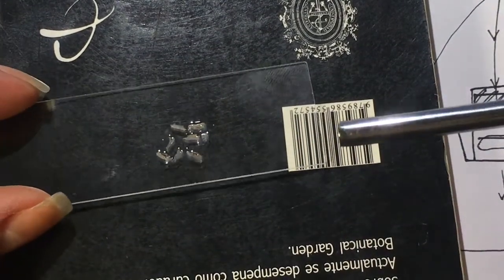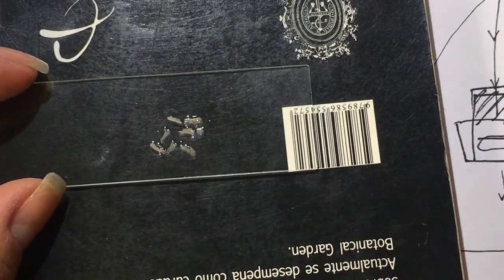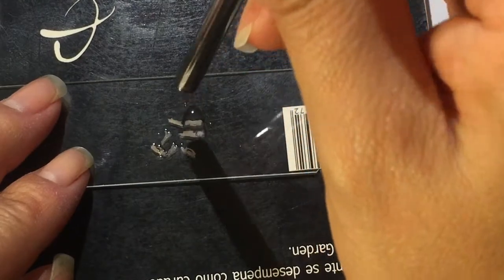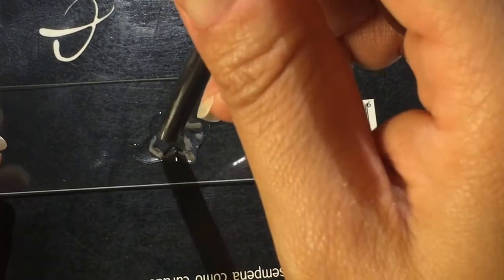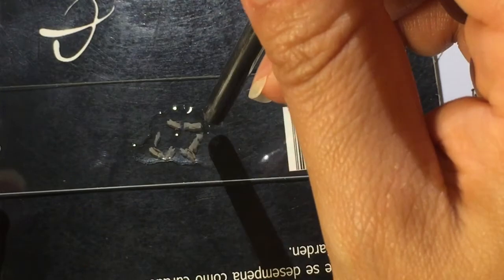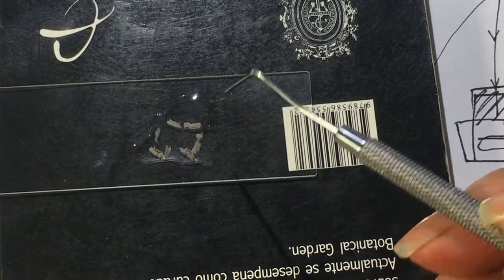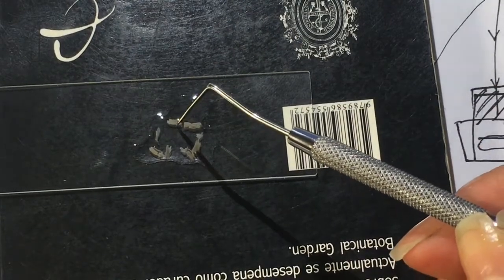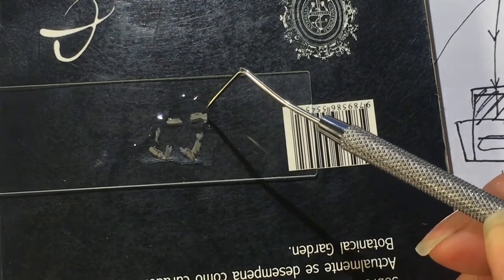Now there's two things you can do. You can add water directly or allow the excess alcohol to evaporate, but I'm just going to add water now. Now obviously this is a lot of water, so before we place into the microscope, we can get rid of the excess with blotting paper. And before I place the cover slip, make sure that you, if possible, try to orient what you've got.